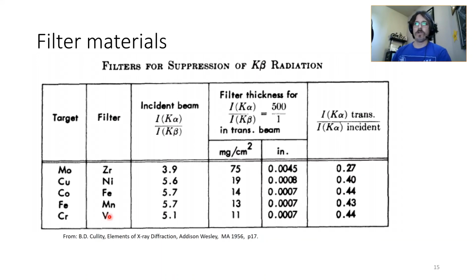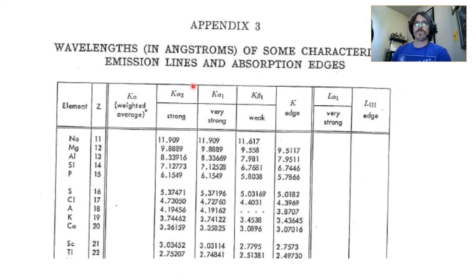It's pretty cool. It's funny, it gives it to you in terms of inches. So anyway, again, from B.D. Cullity, written in the 50s, seminal work on X-ray diffractometry. Here is the absorption edge.